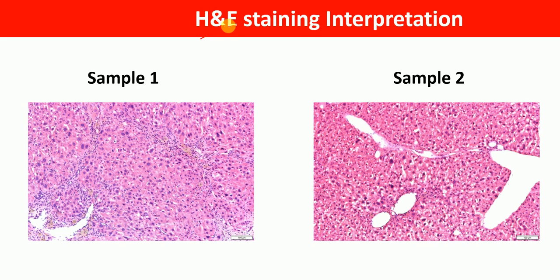To analyze H&E staining results, here we have two pictures: picture one for sample one and picture two for sample two. Comparing the two, in sample one we see more nuclei, indicating more infiltration of cells, whereas in sample two we see fewer nuclei, indicating less cell infiltration. So we can conclude that more cells have infiltrated in sample one compared to sample two.